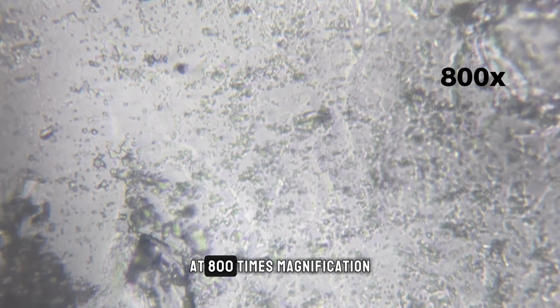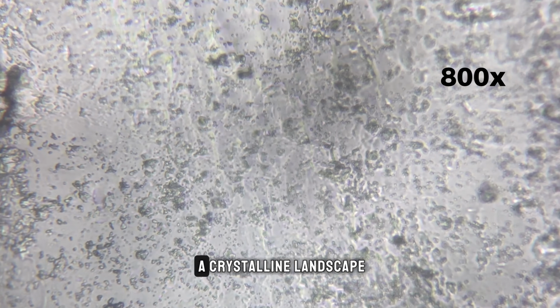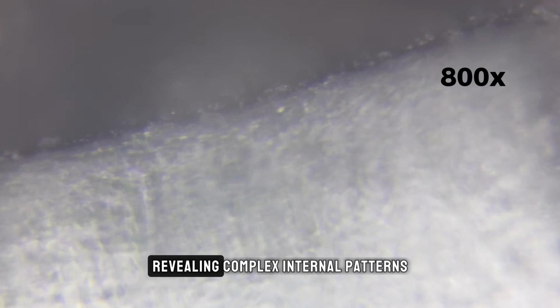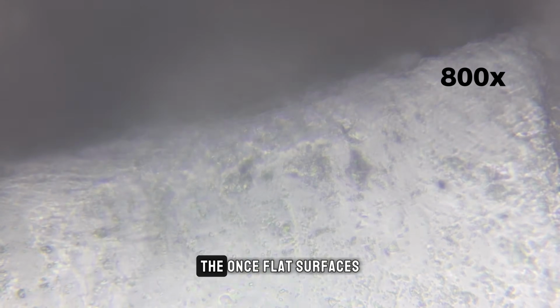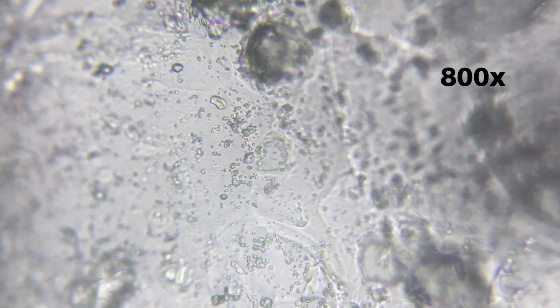At 800 times magnification, sugar fully transforms into a crystalline landscape. Individual crystal faces fill the frame, revealing complex internal patterns and layered textures. The once flat surfaces now appear uneven and granular. Tiny internal boundaries and stress lines run through the crystal like frozen faults.